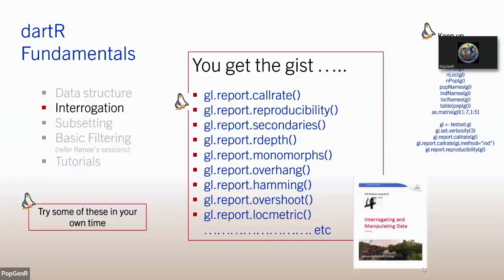You can report on the Hamming distance. So I know that Steve Delean, with his squid study down in South Australia, they did a report on the Hamming distance and decided that they'd filter on a higher Hamming distance than DArT did routinely. So you might want to do that. So that's how close your loci are to each other in terms of how similar their sequence tags are.